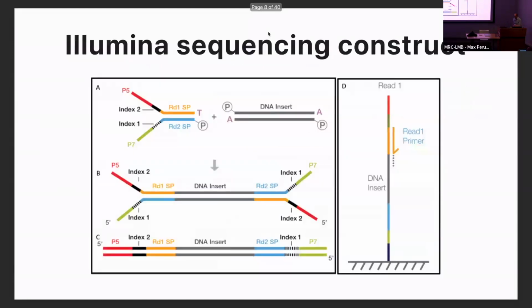So these sequencing machines, they're impressive, but it's sometimes just easy to think about them as this sort of magical black box. You put your sample in and you get sequences out the end. I think it's good to just try and understand the molecular biology that's going on and how the sequencing works to bridge this gap.